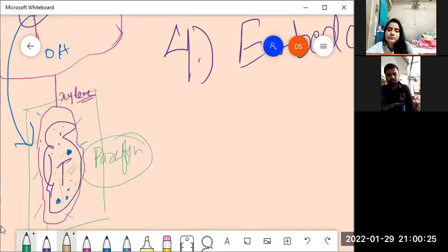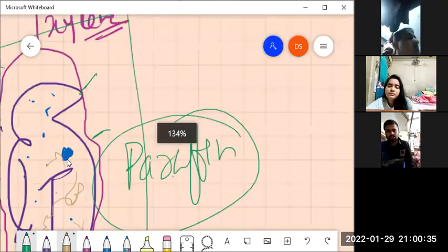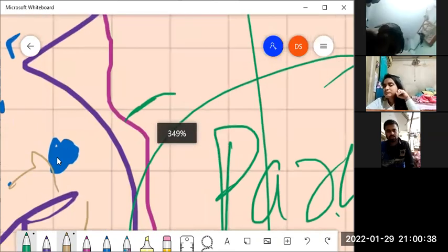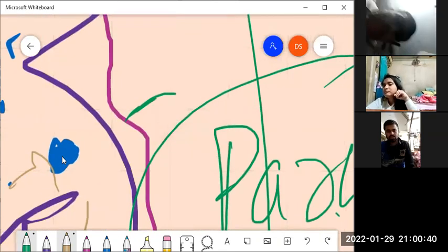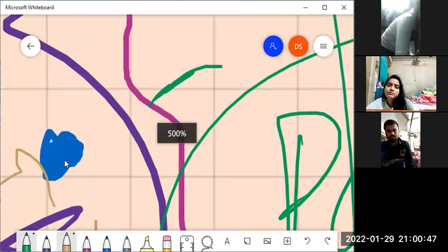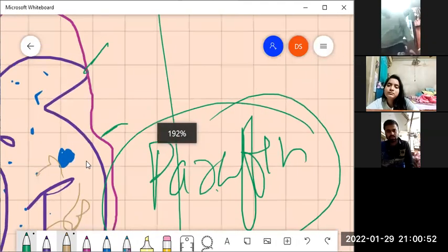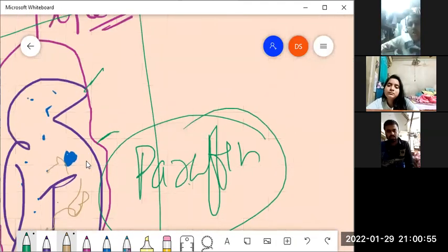Clear? The alcoholic treatment that we did for the dehydration basically acted upon these cells, right? Because the water content that we are speaking of is distributed within the cells mostly. But the extracellular matrix has a relatively less amount of water.